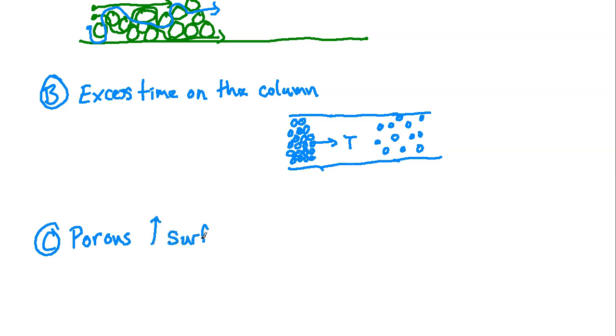So one of the things that we want in order to get good separation from analyte to other analyte, not within the group of analytes themselves, okay, is we want good surface area. Because if we have decent surface area, there's going to be more opportunity for the intermolecular interactions, and that means that hopefully we can get some nice separation and clean retention times, keeping analyte A away from analyte B, or analyte 1 away from analyte 2, and they're not just kind of all clustered together there. Okay, but this can work against you when you're looking within the same band of analyte.